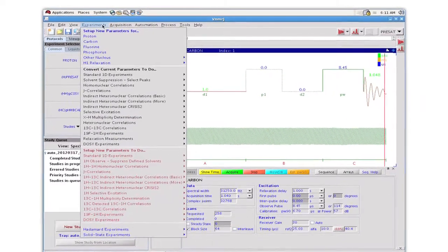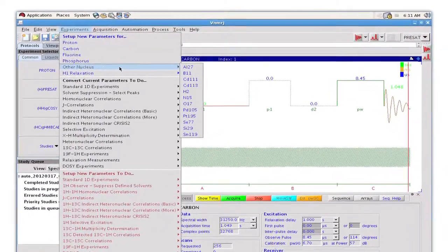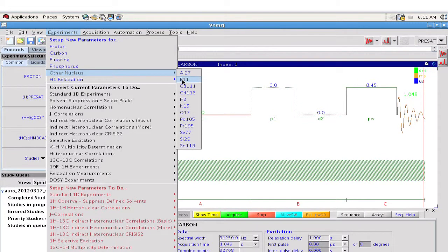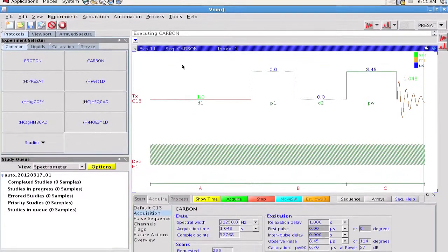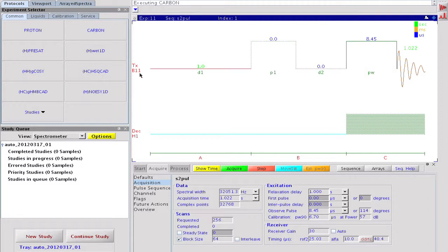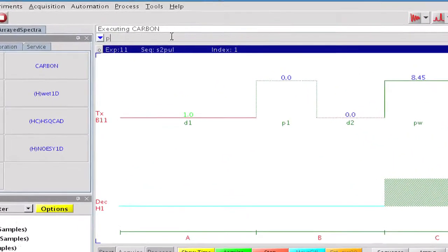First, we go to the experiment menu and request B11 detection. We do not yet have a B11 parameter set, therefore, the default C13 parameters are recalled and the transmitter nucleus gets converted to B11, defining the proper spectrometer frequency. We start from here and build a parameter set for B11, either based on experience or on literature data.